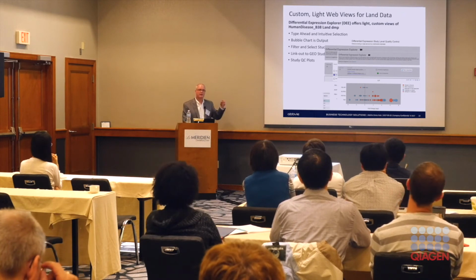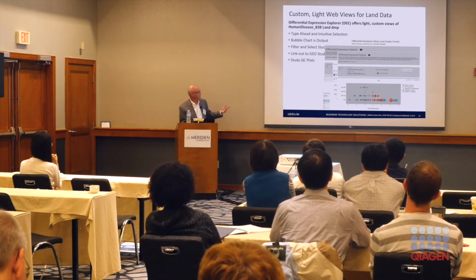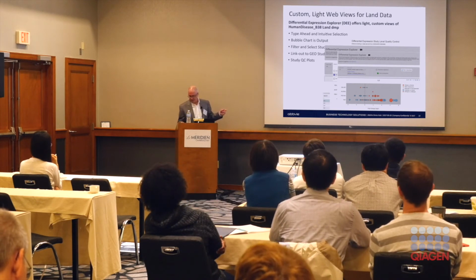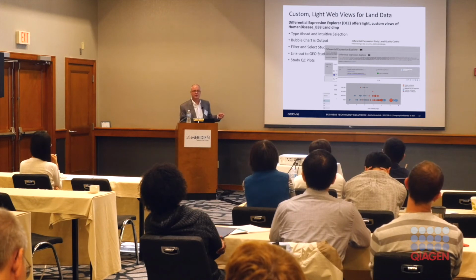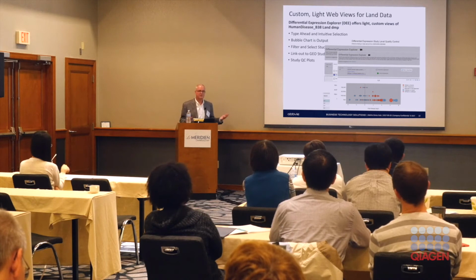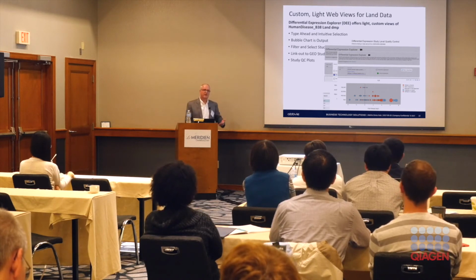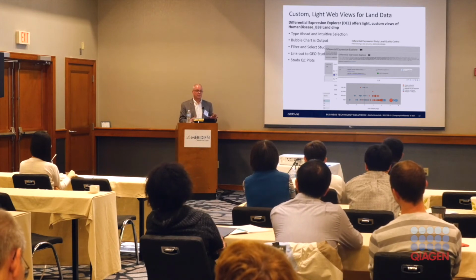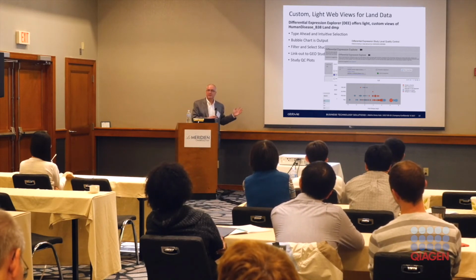So you can just right-click on that and say, all right, well, is this study very good? How's my p-value distribution? How many samples do we have in this? What's the separation in a PCA plot of the treated control or the disease normal? So that's the flexibility that we have just in the light tool, sitting on top of the land dumps.